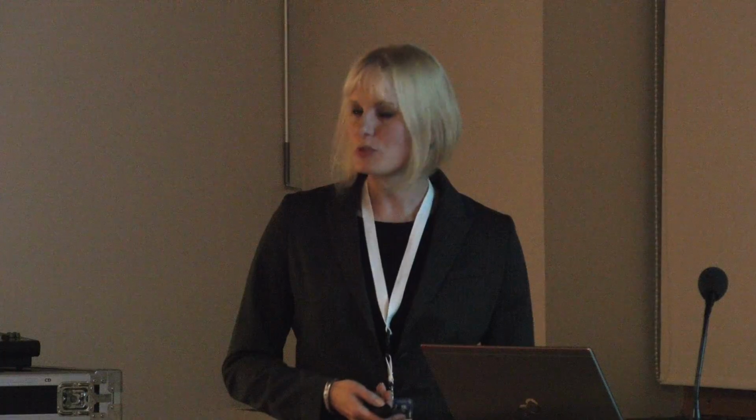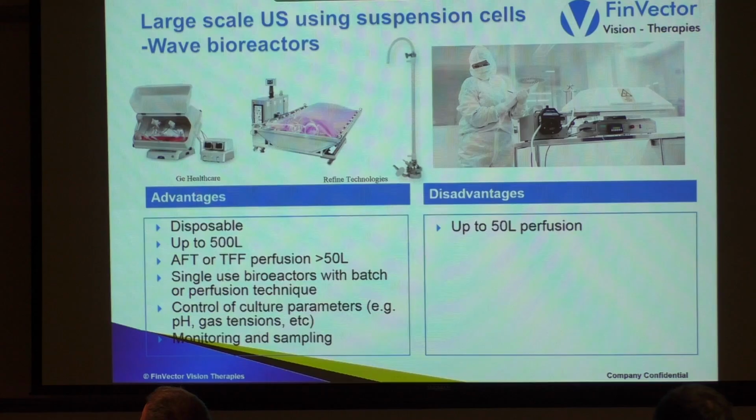One thing is that there's perfusion only in a small scale, so this may not be giving that much scalability. Because I have not used, and none of our collaborators have used, this 500-liter bioreactor, I don't know how the aeration is actually going. I have some doubts that if we go to larger volumes, there's also more liquid. So I wonder if the aeration is really very good when we are going for very high cell densities, when the requirements are high. I also could think how the heating system is really working in this kind of system, but it must be working instead.